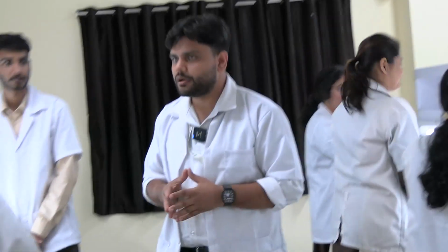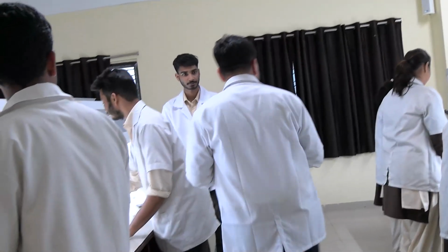So you guys know how to do the oil immersion objective, how to focus. So you're gonna do it yourself today, okay?